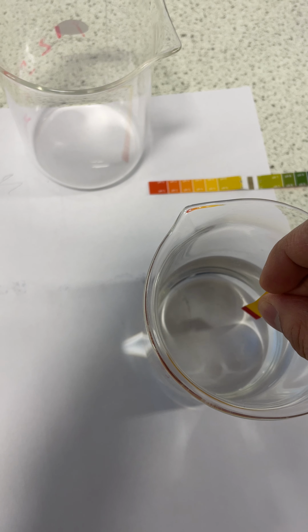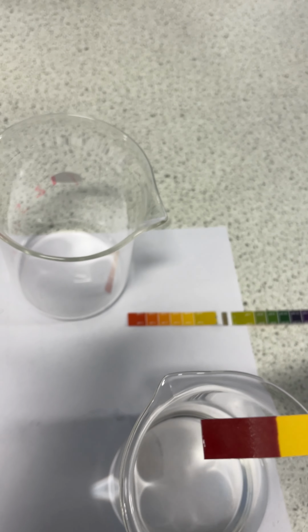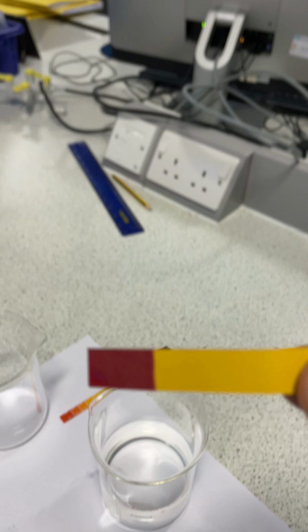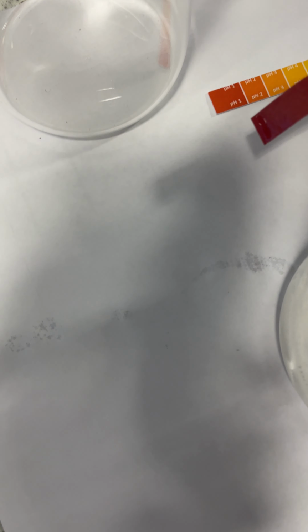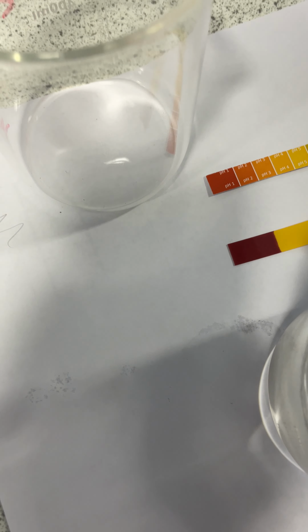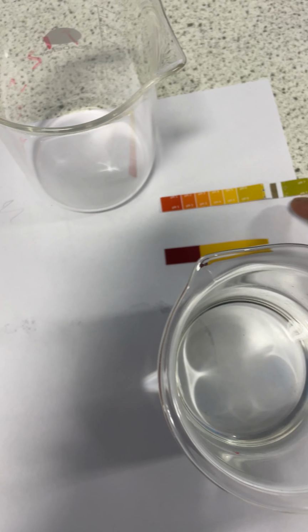Don't need to dip the whole thing in. As soon as I lift that up, you can see clearly, well, when I take my shadow off the camera, a nice red, okay? And that red will tell us that it's pH 1, it's a strong acid, okay? Now water itself comes in as pH 7 neutral.